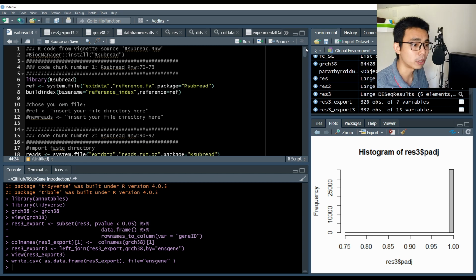So that's it for now. I will try to do another video on this with a deeper dive into the experimental design for DESeq2, and try to actually get a narrative out of that, which they already do in the paper.